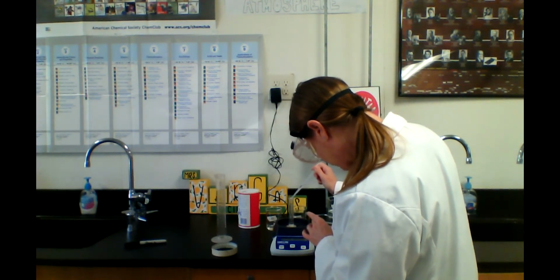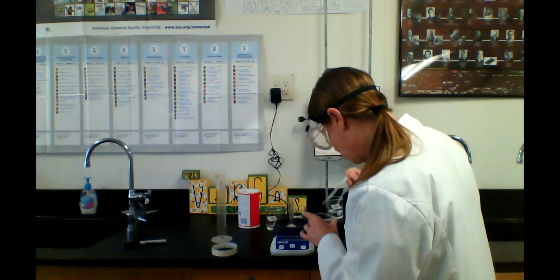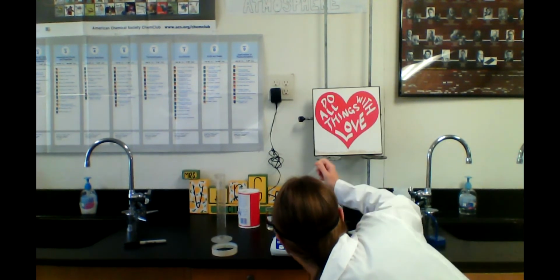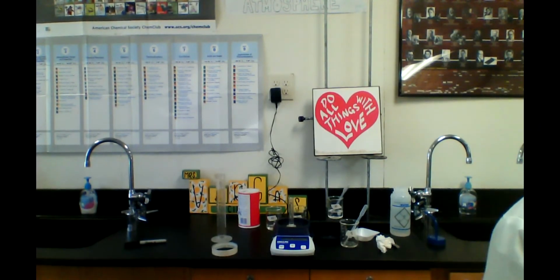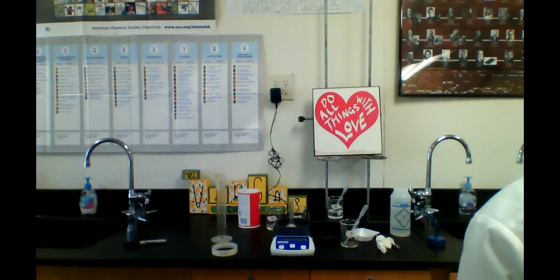Getting very close to that 10 milliliters. And we need 1 or 2 more drops down at eye level. There we go, perfect. We needed 8 more drops. So now let's record our data. For 5% sodium chloride, it's 10.11 grams. And remember that the volume is 10 milliliters.